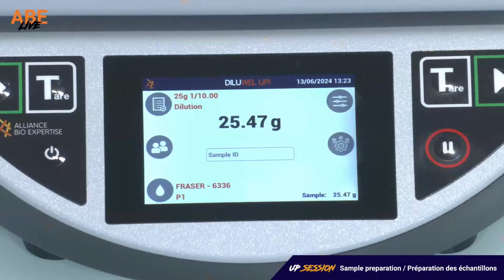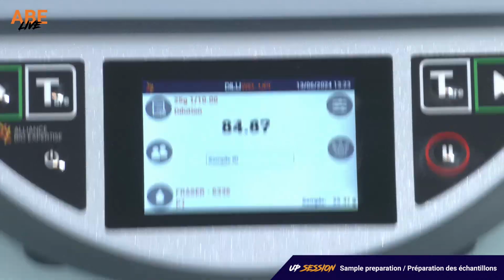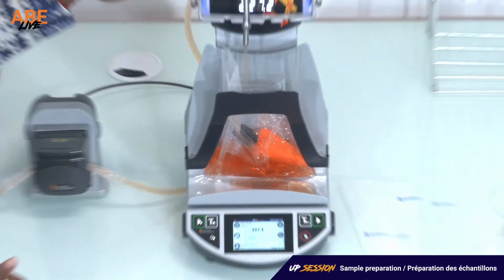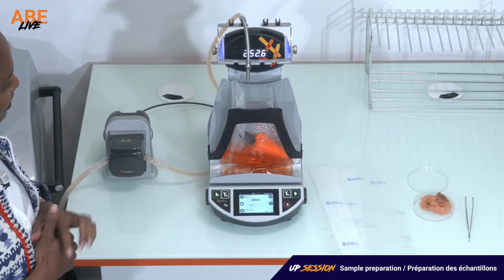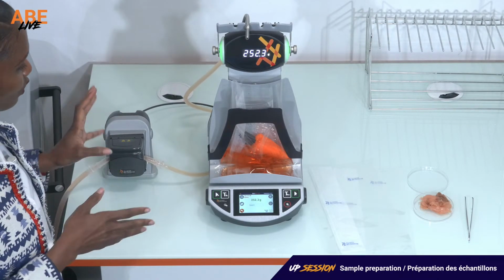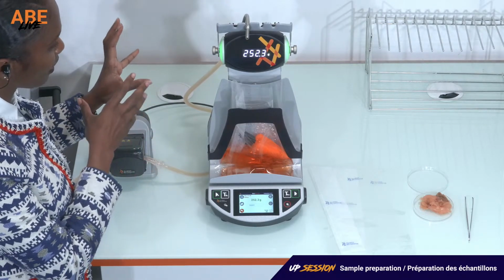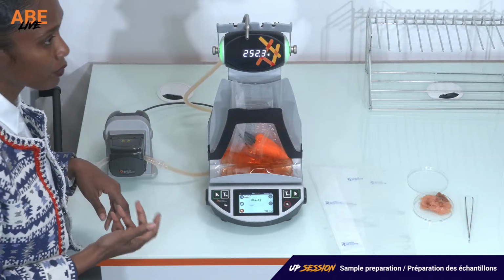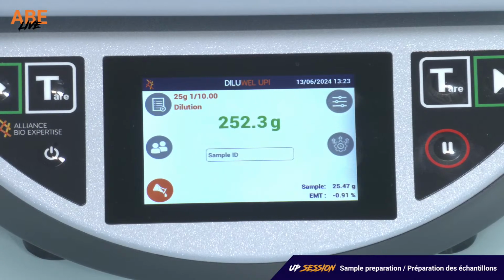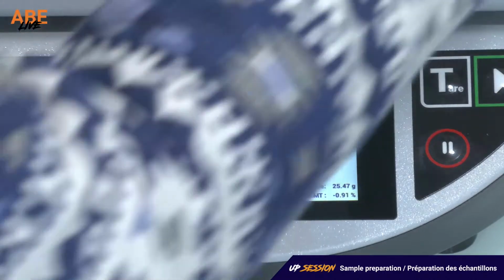I can see that the head is activating and that my diluent is dispensing. I have the weight information here at the head level, and I know that I finish my dilution once it turns back green. So all the information is on the high display. And if I want to know more about what happened during my dilution, I can see on my screen the initial sample weight, and I can see that my tolerated maximum deviation is 0.91%. So I'm well within my range, so my dilution is okay.